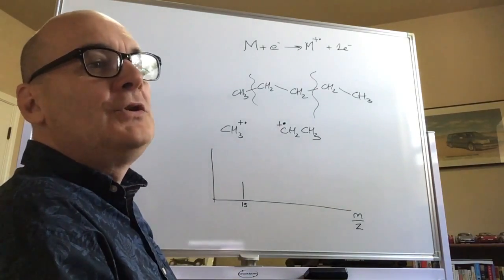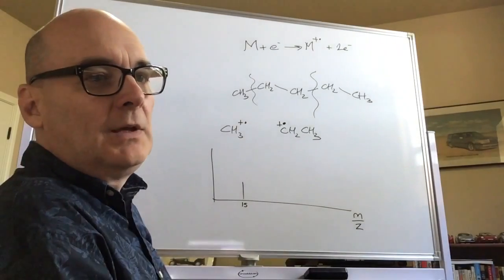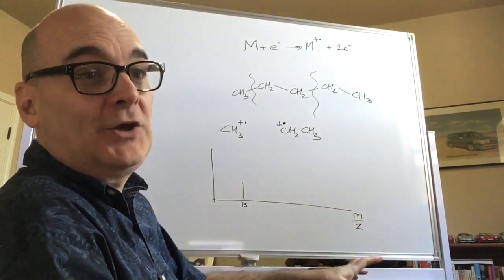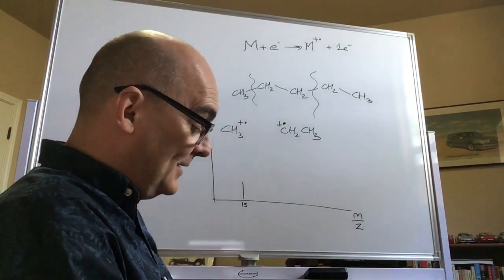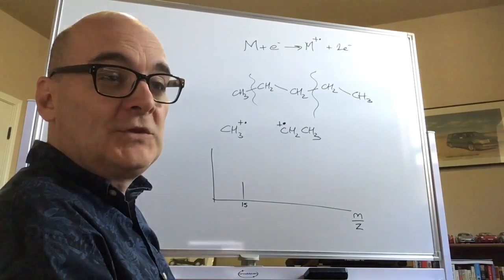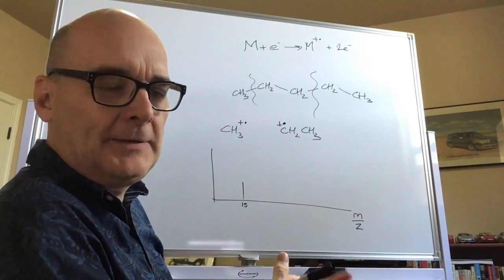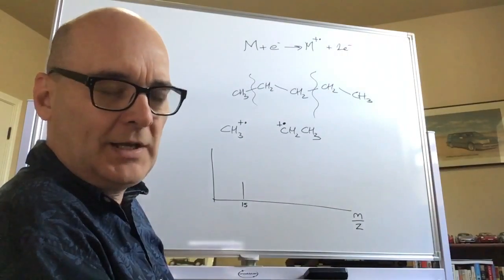Now, even though you know that you have methyls in your molecule, you might not get to see them because they're small and they're a gas, and they might be lost to the vacuum because they are so small. Plus, remember, it depends what technique we used to do the ionization. Before we broke up, we talked about EI, electron impact, and CI, chemical ionization.